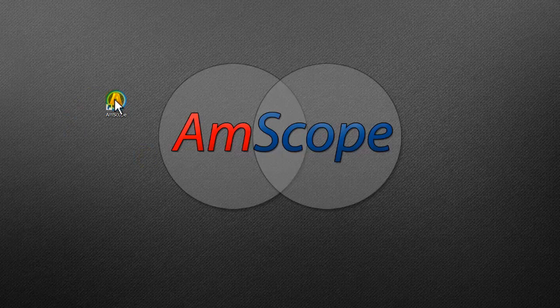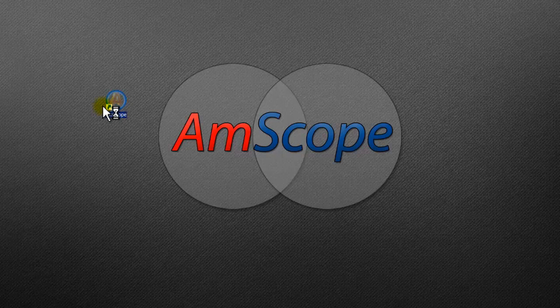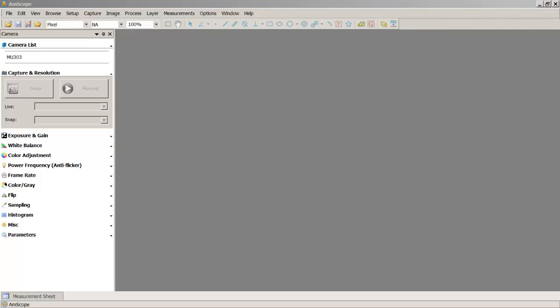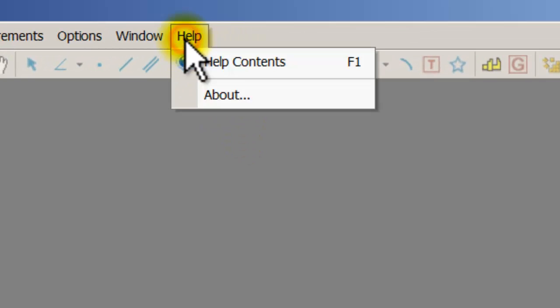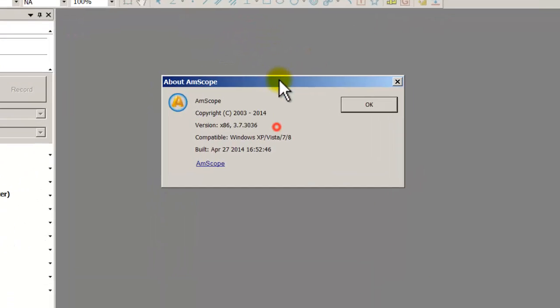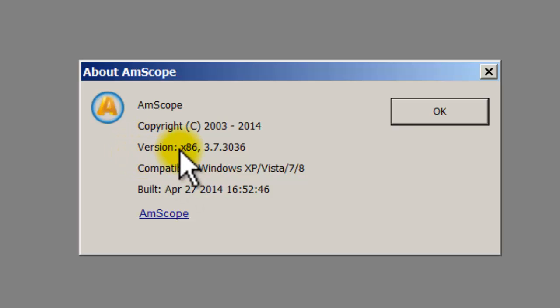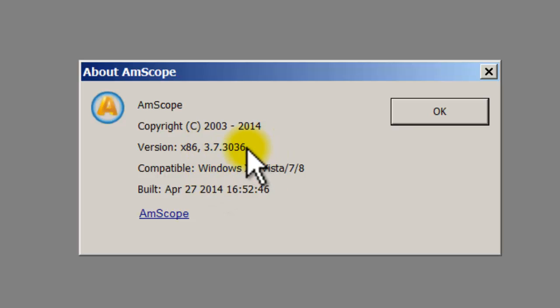First things first, make sure your software is installed. The newest version we have is 3.7.3036. Let me go ahead and open this up and show you how to check it. Double-click to open the software, then go to Help and click About — it gives you all the information about your current software. Version x86 3.7.3036 is the most recent version. If you don't have that, I'll include the download link in the comments below from our Dropbox link.